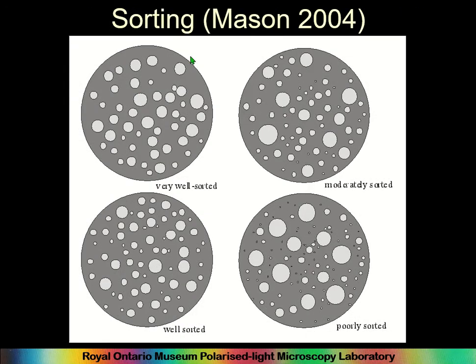Yeah, there we go. So I actually used that and used a graphics program to make it look more like pottery. So we have the matrix here and the grains floating in it, just like we have inclusions in pottery. But it's exactly the same, only spread out. So this is based directly on the Petitjean data and with the same terminology, but it works better for pottery. So there you go. This is in the manual.